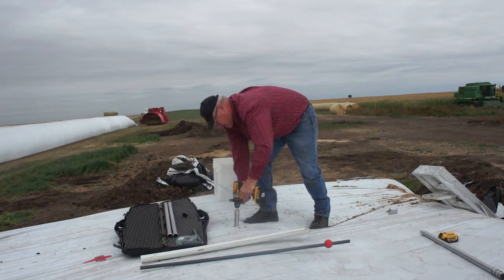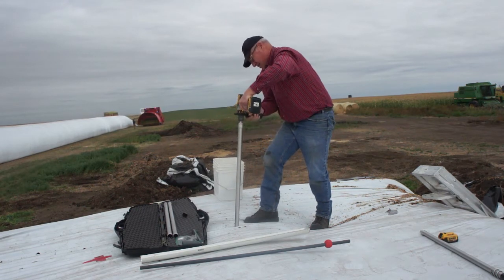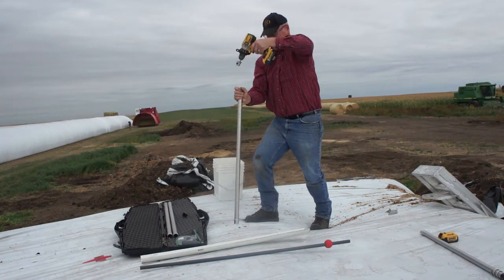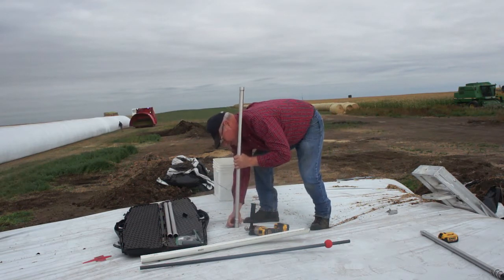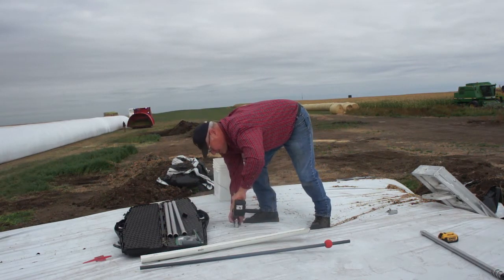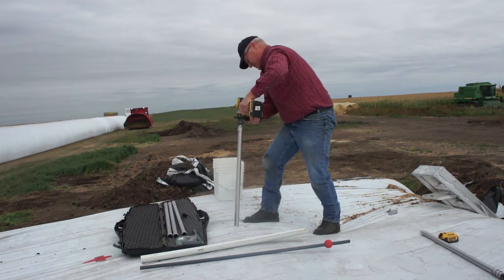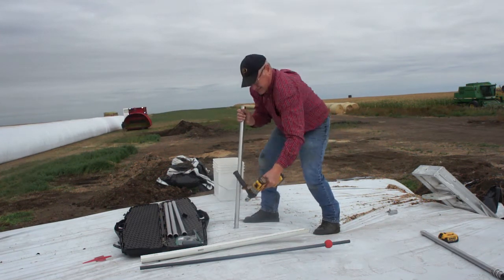When you stop and reverse the drill, you want to be hanging on with two hands because there's a lot of torque and it can be hard on your wrist if you're not. Even with only one probe left in, you still want to have a good grip so that it doesn't jerk your wrist.